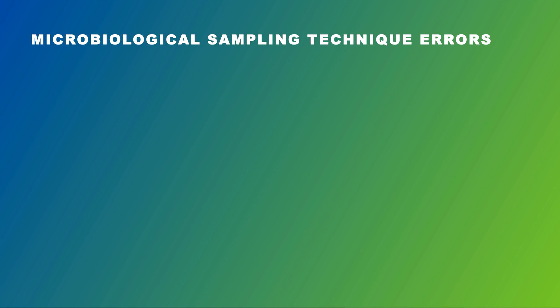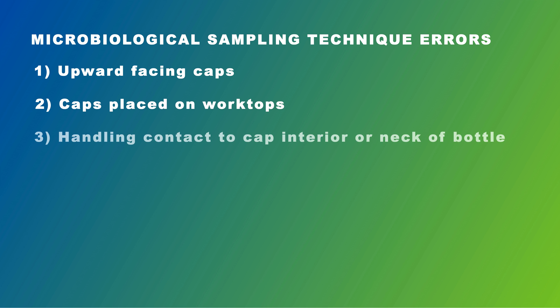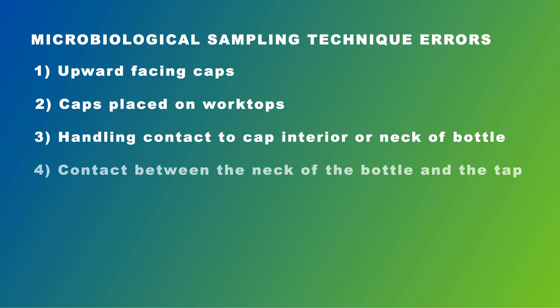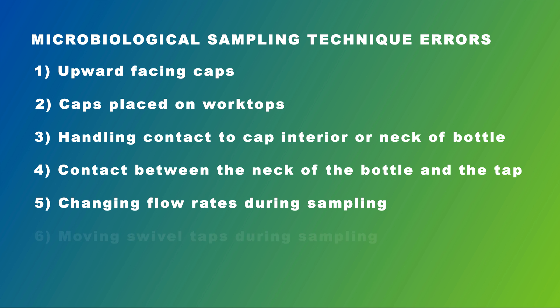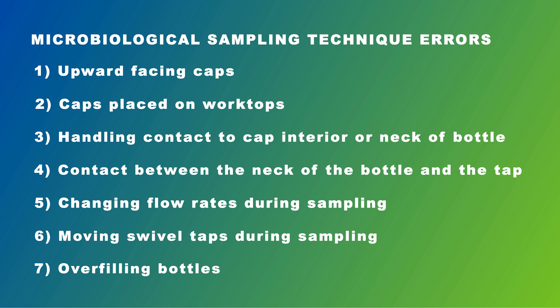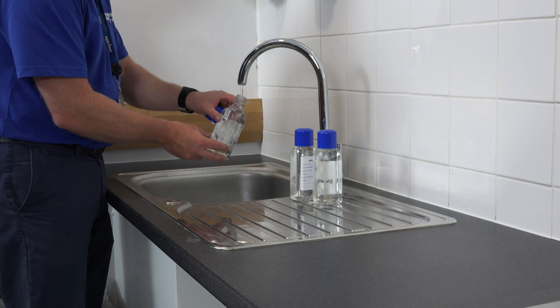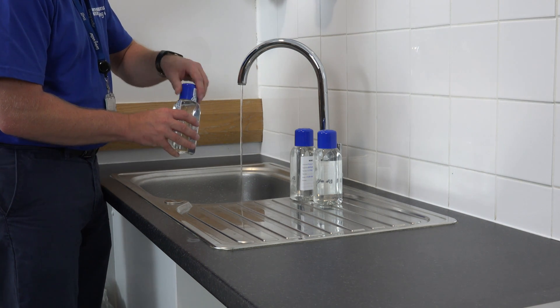In summary, you should avoid the following microbiological sampling technique errors: upward facing caps; caps placed on work tops; handling contact to the interior of the cap or to the neck of the sampling bottle; contact between the neck of the sampling bottle and the tap; changing flow rate during sampling; moving swivel taps during sampling; and overfilling bottles. Avoiding all of these technique errors, repeat the sampling process until all microbiological samples required at that tap have been taken.